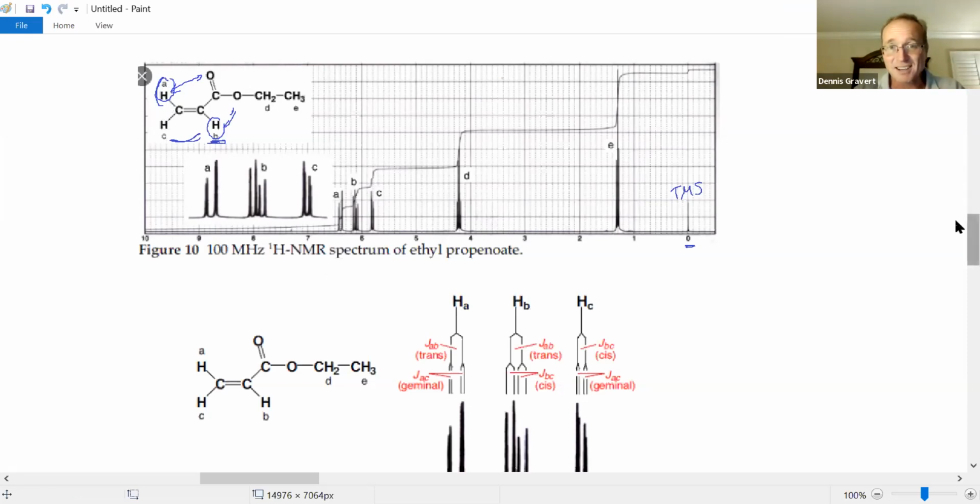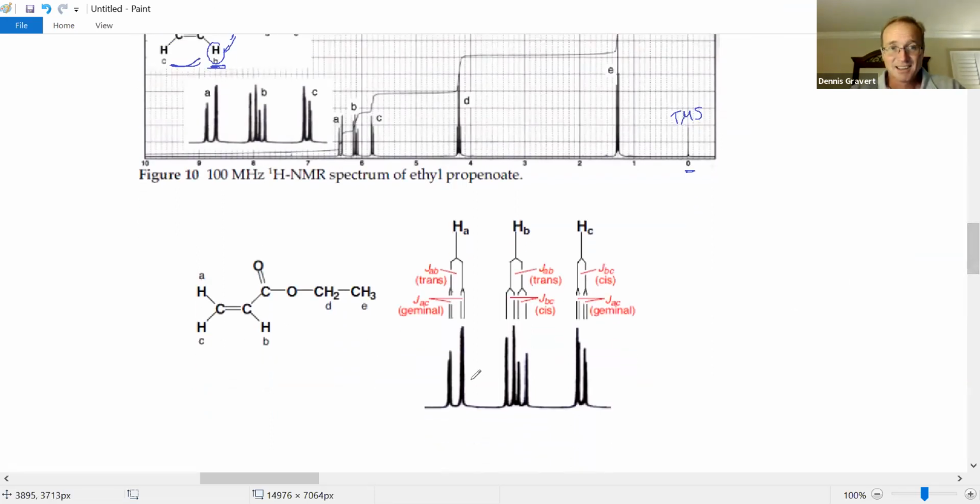So if we go down here, and we got peak A, so hydrogen A, you're being split into a doublet. But then, if we could zoom in more, it turns out there is a tiny little doublet here and a tiny little doublet there produced by this neighbor. Wait, you live in the same house. I know, it's the exception.